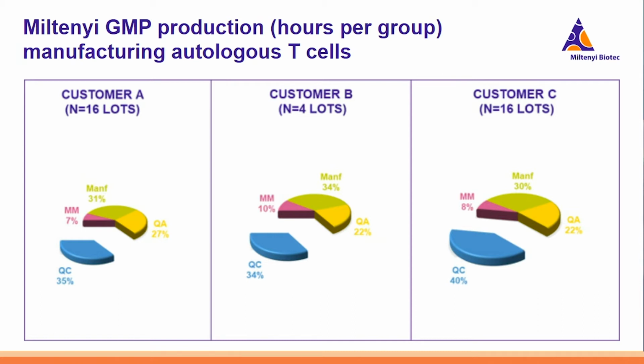As we are developing these methods, we want to make sure that these methods are fit for purpose, especially by the time that we get to QC. Otherwise, we will spend more time developing them for this purpose while we are in the actual manufacturing, and this is really a challenge for the field. We should aim to be ready by the time that we get there.